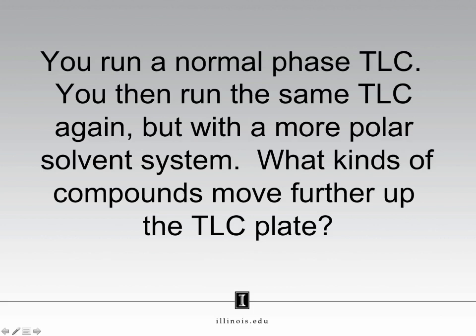Therefore, the answer to this question is that because we are increasing the polarity of the solvent system, we are increasing the strength of the eluent, so all compounds should move farther across the TLC plate. The polarity of the compounds themselves is entirely irrelevant. The polarity of the stationary phase is what determines the order in which compounds move, or what we call elute, up a TLC plate. The mobile phase is what determines exactly how far these compounds will elute. The mobile phase will never change the order in which compounds move up a TLC plate.